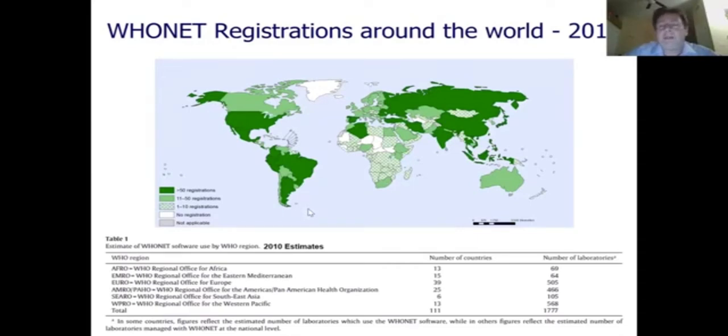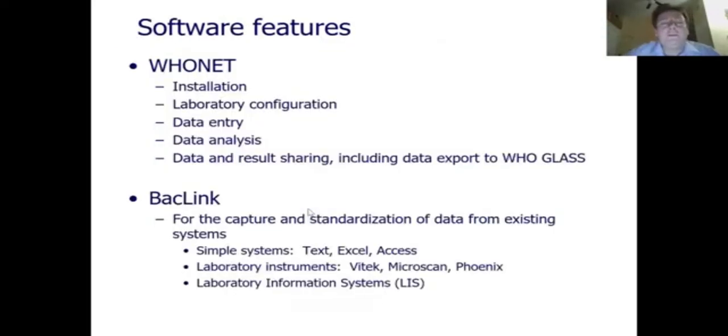We currently estimate about 130 countries utilize WHONET and perhaps around 3,000 laboratories, mostly hospital laboratories, also public health, food, and veterinary laboratories. In January will be the 30 year anniversary of the creation of the WHONET name and the WHONET software. I continued Dr. Bryan's work from previously, so we're going to repeat the survey in the new year. So we'll talk about two softwares on the webinar today.